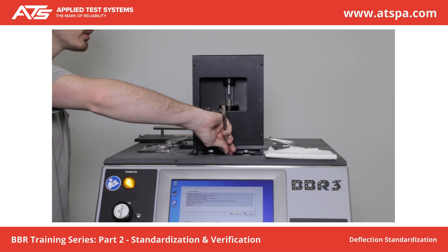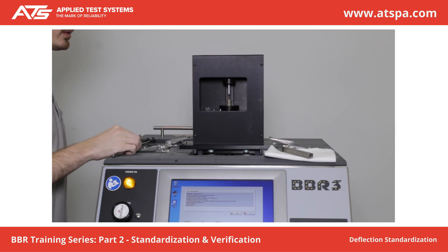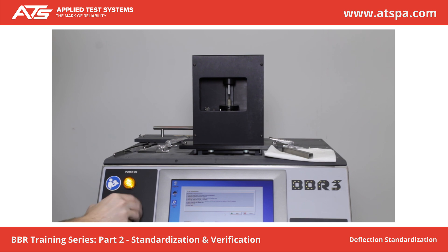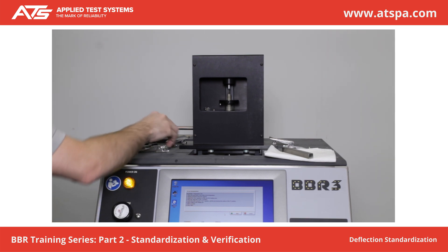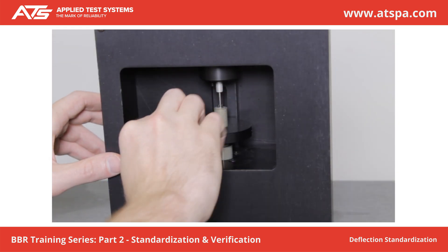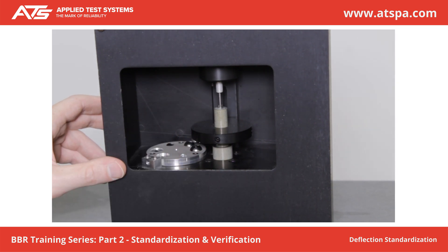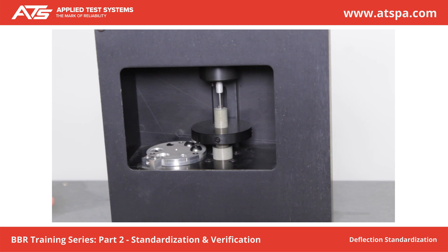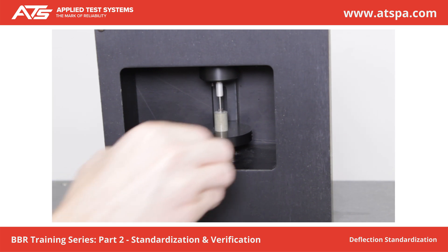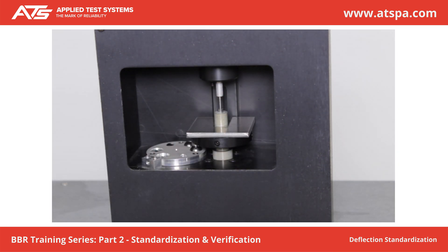Remove all beams from the supports. Adjust the zero regulator to fully raise the loading nose. Place the step disc in the zero position. Lower the shaft using the zero regulator until the pin touches the surface of the zero position. Place 100 grams on the weight pan. Wait 5 seconds. Press Next.